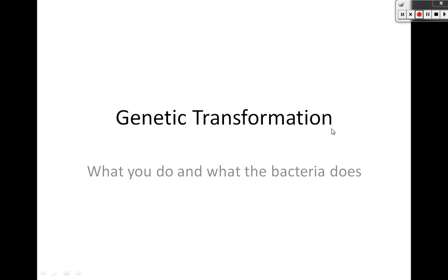These are notes on genetic transformation. So it's going to kind of walk you through the main parts of the procedure, and I'm going to show you what you do, so really looking at what it is you're going to see, and then what the bacteria does, so that you can see what's going on at the level that you can't see.